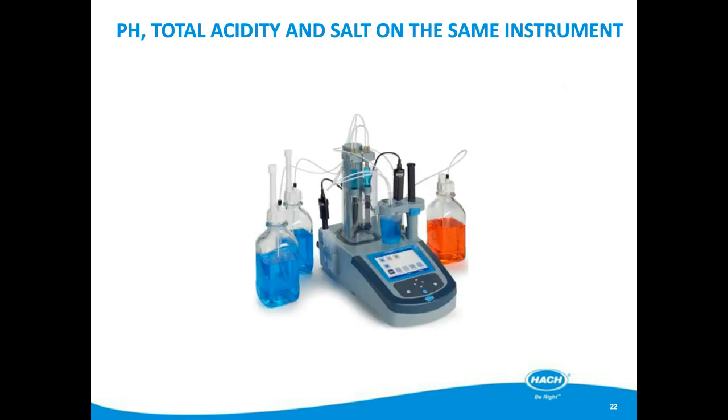One thing which is interesting also to know is we use one titrant for total acidity and we use another titrant for salt. So it means that if you have an instrument with two burettes, with the same instrument you are able to manage two different titrants. You can perform total acidity and salt on the same instrument.